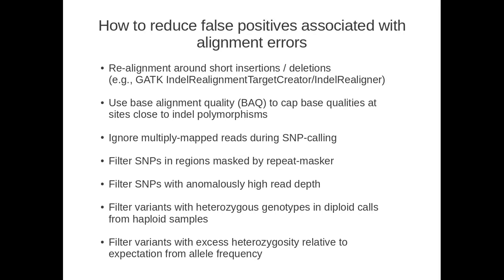So one criterion might be to use a program called RepeatMasker to identify repetitive regions in the reference genome, and then simply not call SNPs in the repetitive regions, because repetitive regions are notoriously difficult to sequence and enriched for false positives in the SNP calling sets.